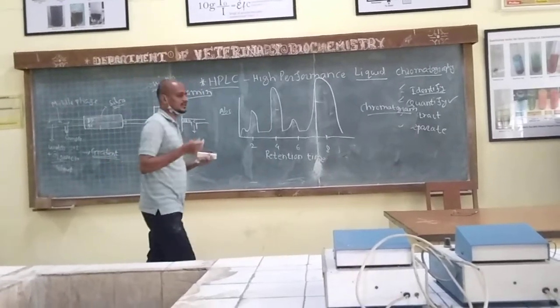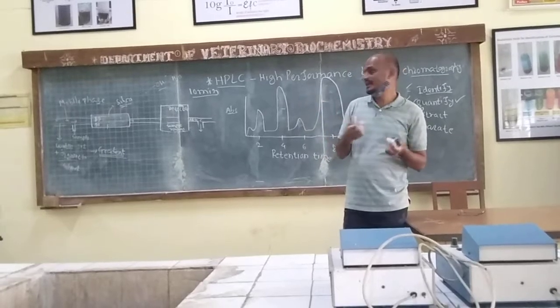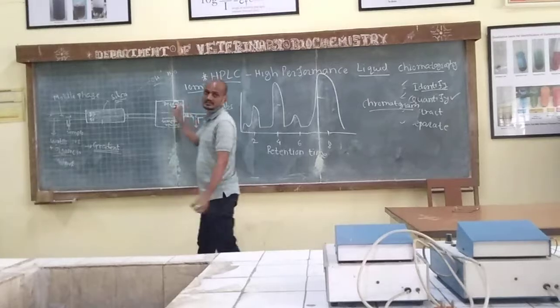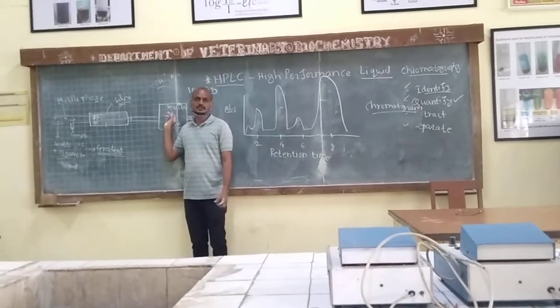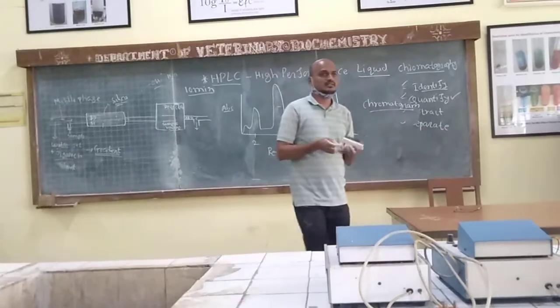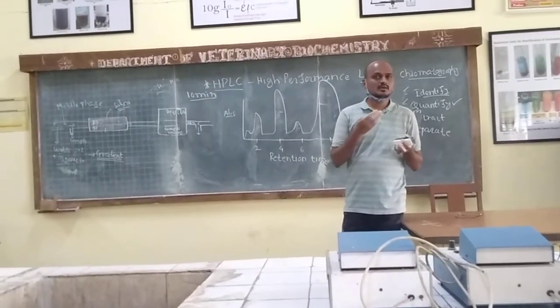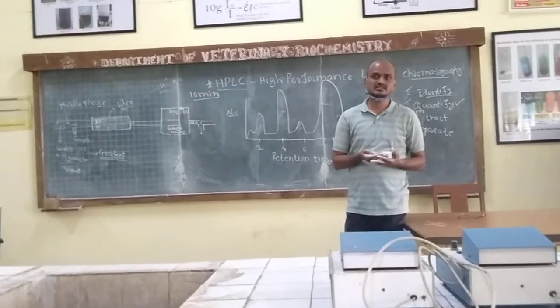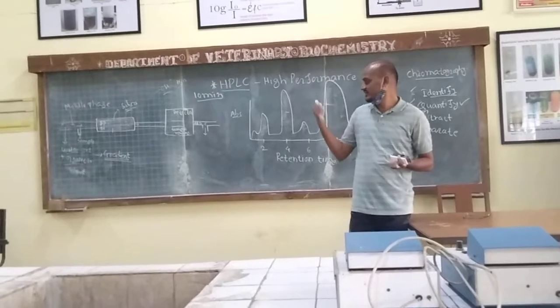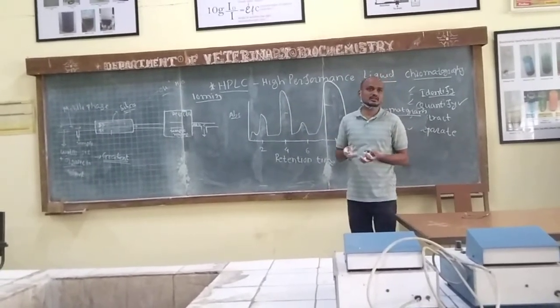Different compounds have different wavelengths. So if you apply a different wavelength in this detector, then you can detect multiple samples. For example, glucose estimation, cholesterol estimation, and total protein estimation: for each particular quantitative estimation, we use a particular wavelength of light in the spectrophotometer. Likewise, if you use a different wavelength, we will get to know the different compounds here.